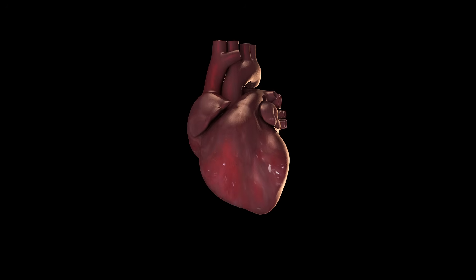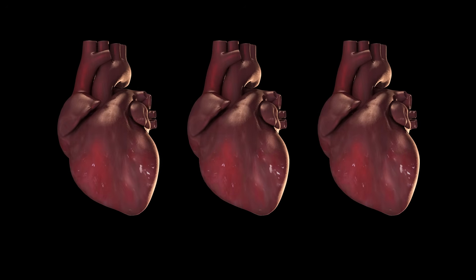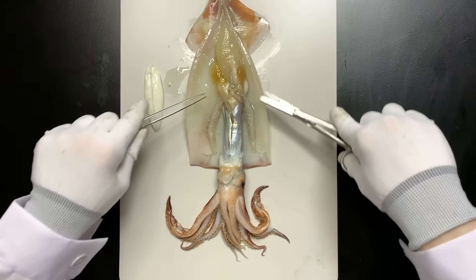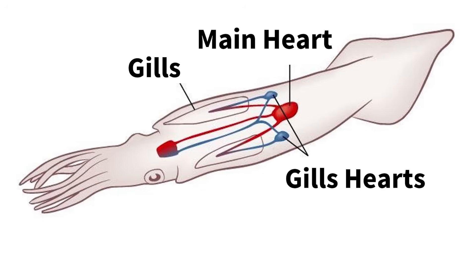Another unique feature: squid have three hearts. Here are the gills, and above them are two branchial hearts. In the center is the main heart — three in total. The gill hearts help the main heart pump blood and supply oxygen efficiently.